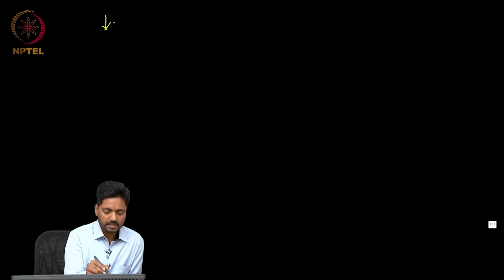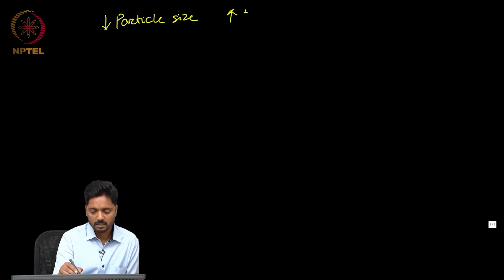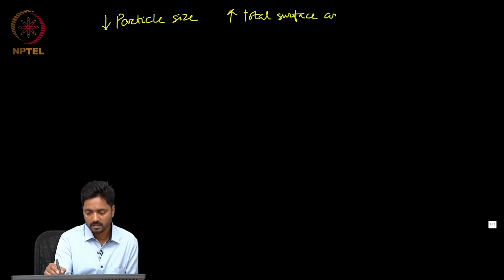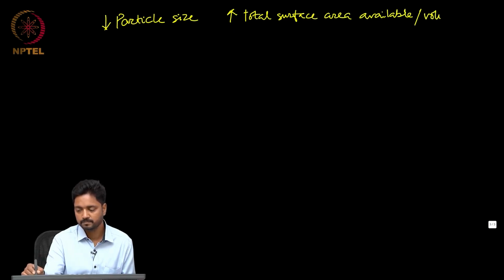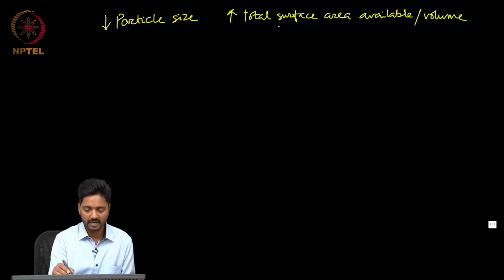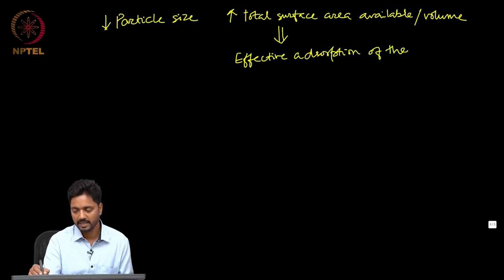So, reduction of the particle size increases the total surface area available per unit volume, and that allows effective adsorption of the analyte.